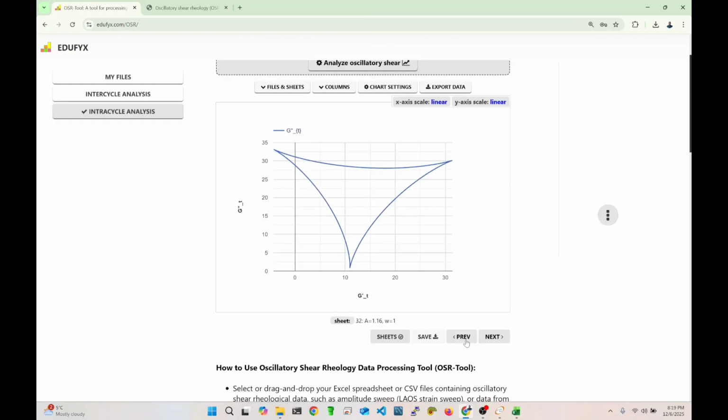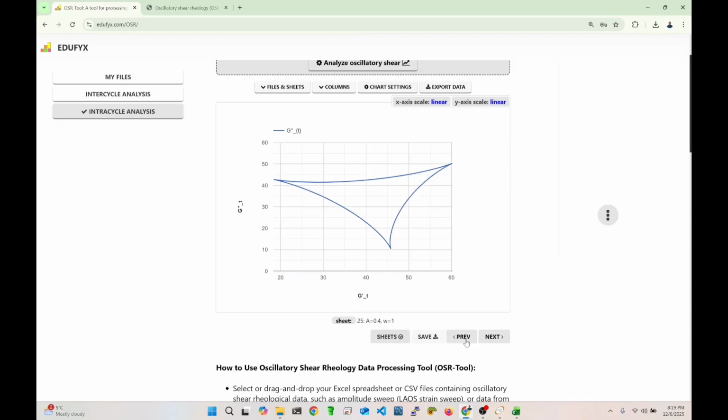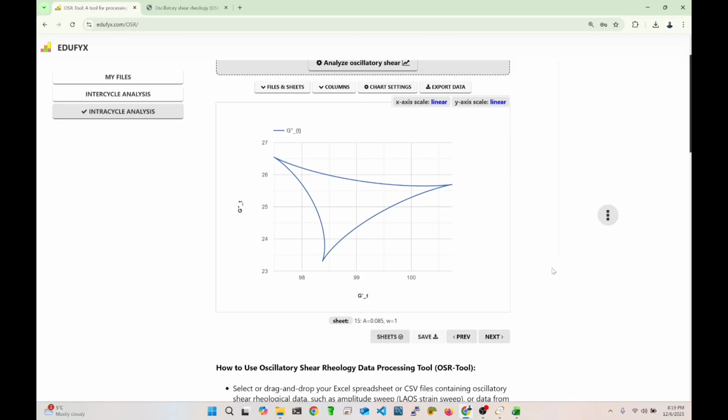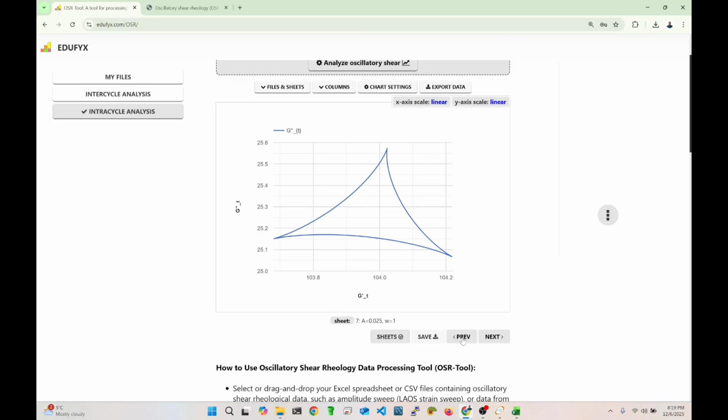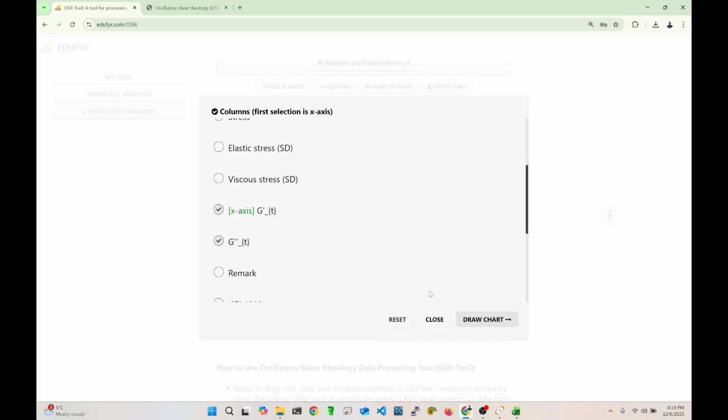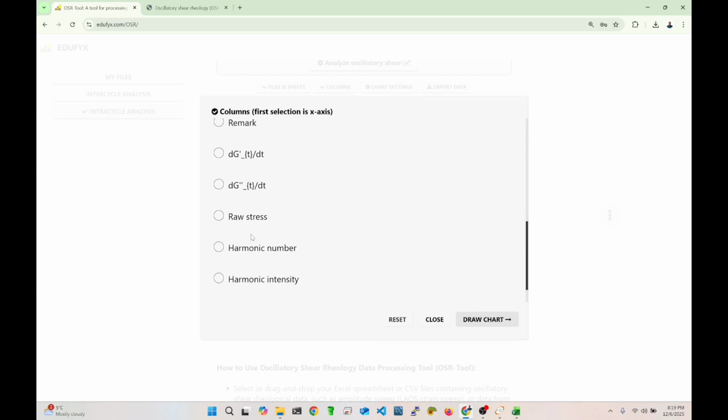You don't want to use this stress filtering at high strain amplitude when you are aware that there are other stress harmonic components within the data. So it's useful when you are dealing with the small amplitude region. And one interesting thing we can now do here, because we used stress filtering, is to plot the time and the stress data. This stress is the filtered stress, right? Because we did stress filtering, and the raw stress means the original unfiltered stress.